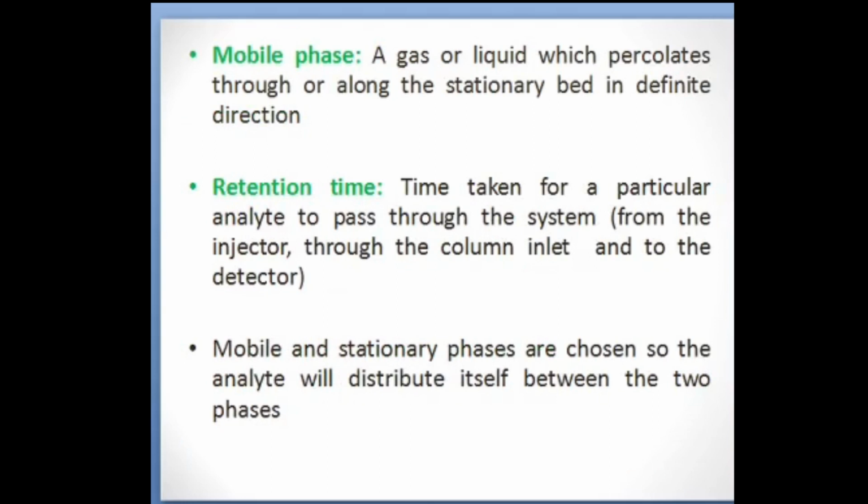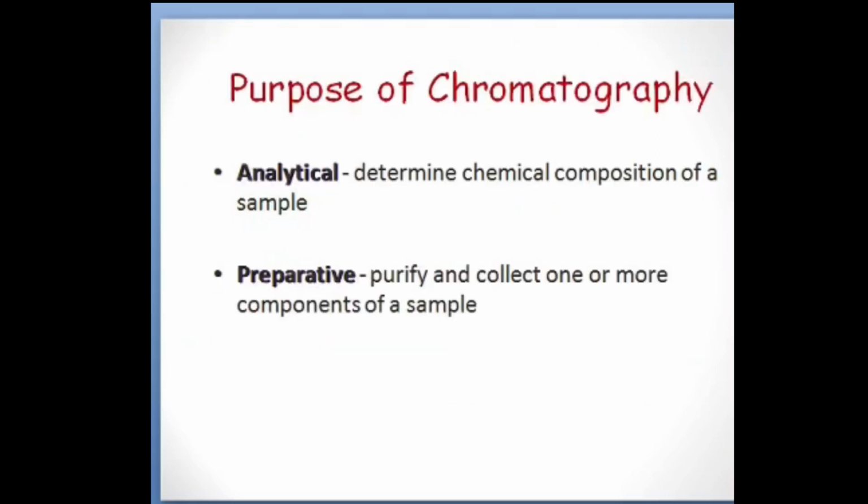Then what is mobile phase? So mobile phase is the gas or liquid. It can be either gas or liquid which will percolate or enter through or along the stationary bed in a definite direction. Then what is the retention time? Retention time is the time taken for a particular analyte to pass through the system. So you'll come across these terms again and again.